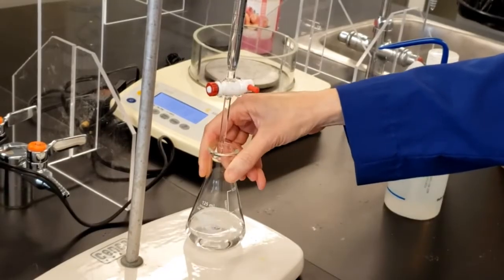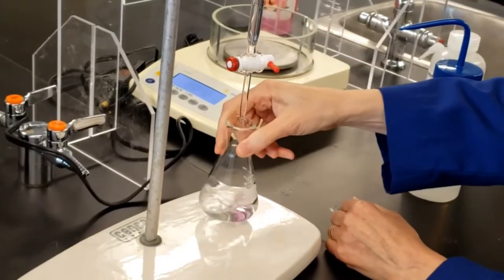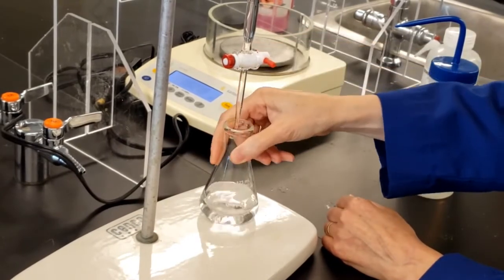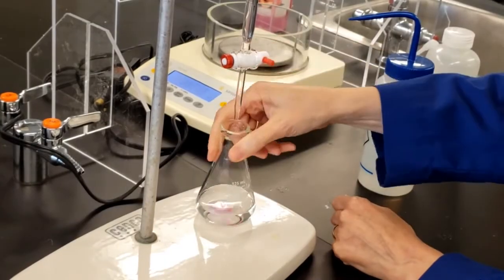Once a trace of pink starts to appear, slow down and continue the titration dropwise until the end point. Prior to reaching the end point, the pink color will disappear after swirling. You may periodically use water to rinse the end of the burette as it may add smaller amounts of titrant than with a quick twist of the stopcock.